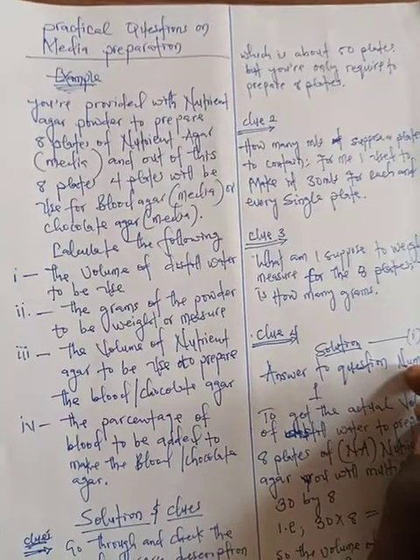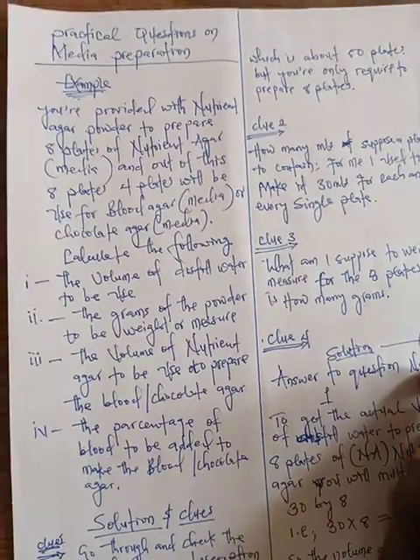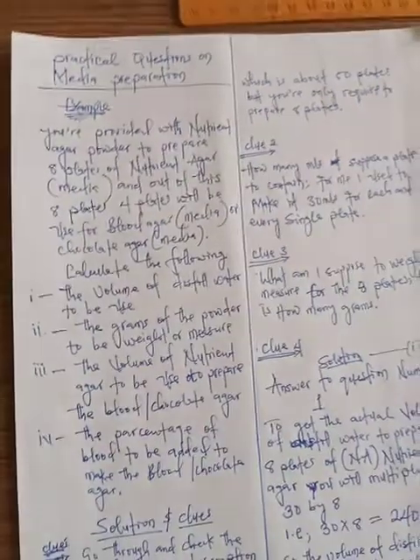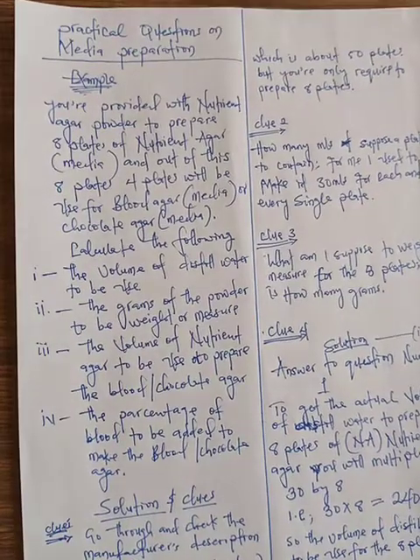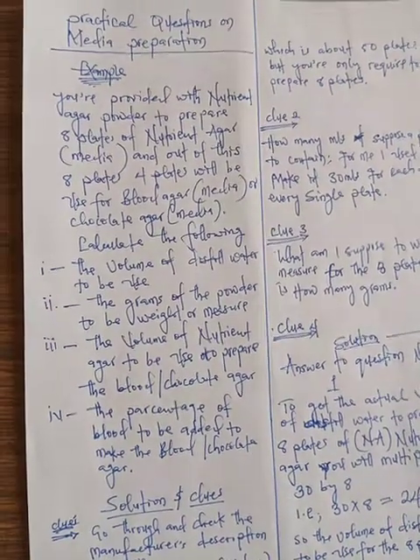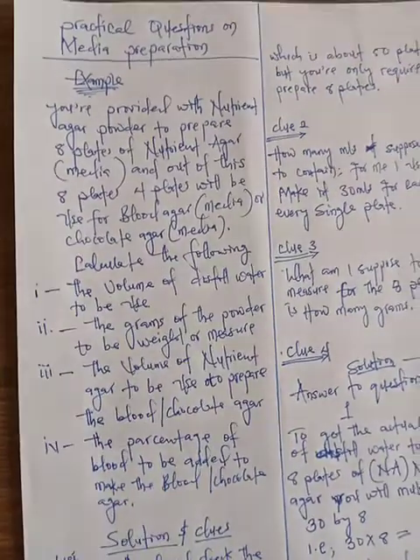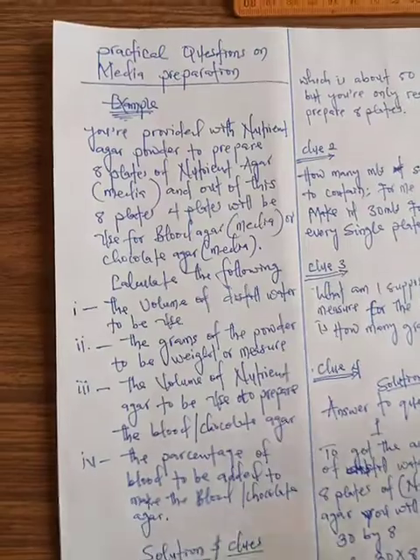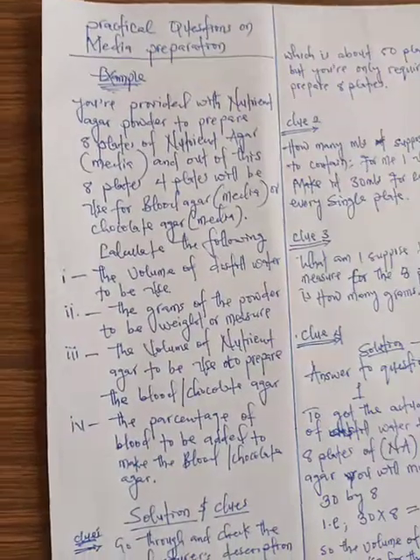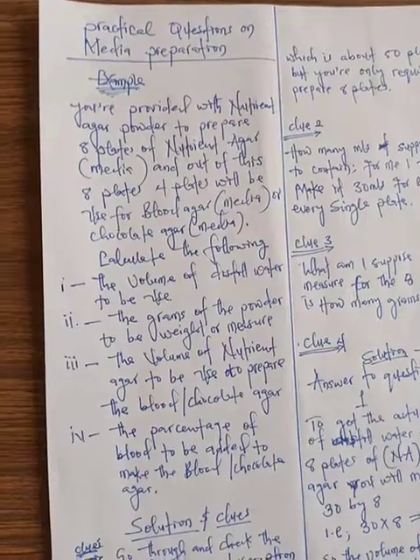Okay, so today we will be discussing practical questions on media preparations. Here with me, I have a small example I want us to share, and it's very simple. The question says you are provided with nutrient agar powder to prepare 8 plates of nutrient agar or media.